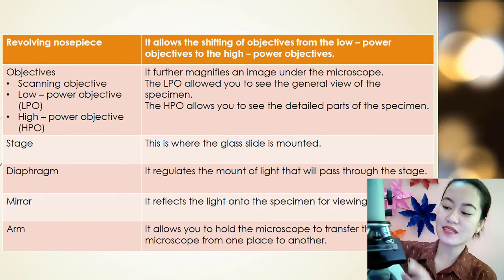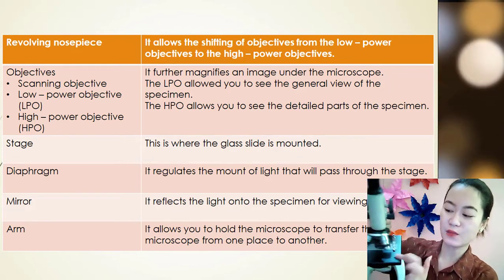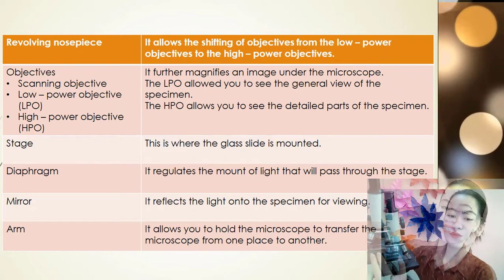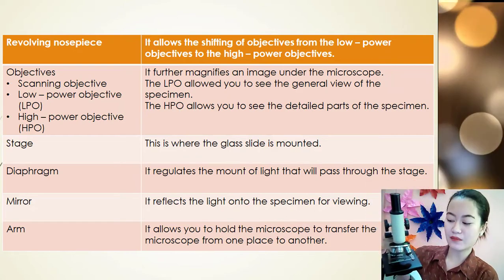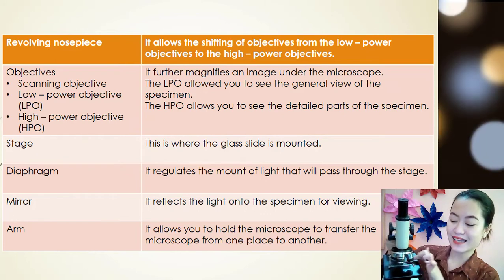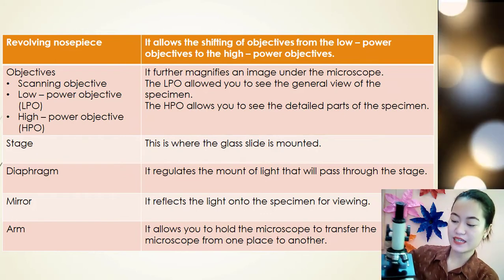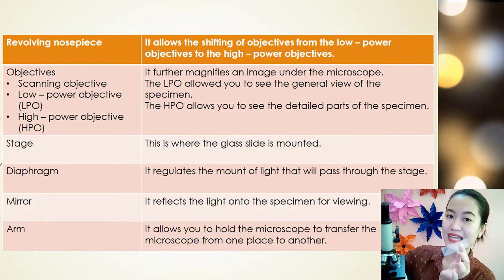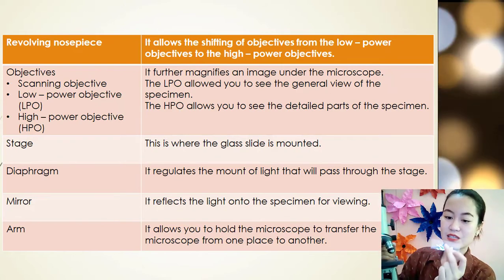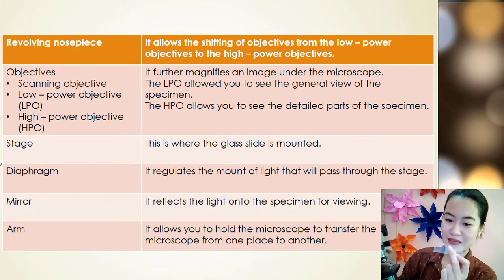Okay, class? So this is the stage. Okay, this is the stage. What is the function of stage? This is where the glass slide is mounted. Okay, so this is the glass slide or the sliding glass na tinatawag. Natatanggal yan. So dito nilalagay, class, yung specimen. Okay? So, dito nilalagay yung specimen sa ibabaw.